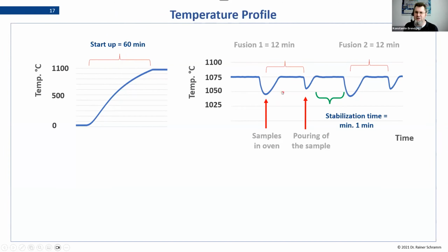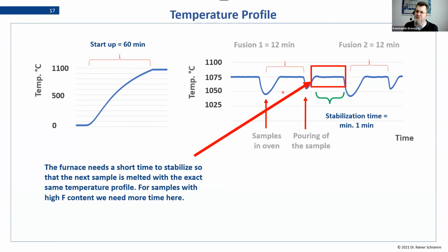And then the critical part is, if you run a series of samples, one preparation after the other, you have to make sure that the machine has enough time in between those samples to get to a stable temperature again. Because each time you load and unload, the temperature will drop, the machine will react by doing more heating, and you will end up with these little squiggly lines.